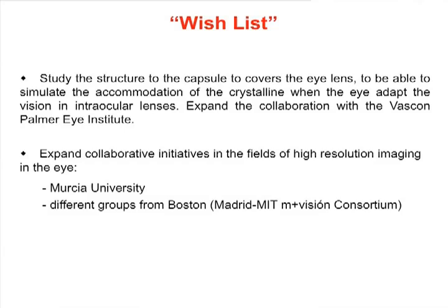The main goal we have is the study of the structure of the capsule covering the eye lens, to be able to simulate the accommodation of the crystalline lens when vision adapts with intraocular lenses, and to expand the collaborations we have with the Bascom Palmer Eye Institute in Miami, and expand collaboration initiatives in the fields of high resolution imaging in the eye, collaborations that we have with the University of Murcia, with different groups from Boston, from this Madrid MIT consortium, and start new collaborations with groups interested in these topics, of course.